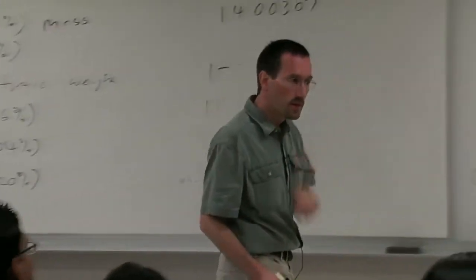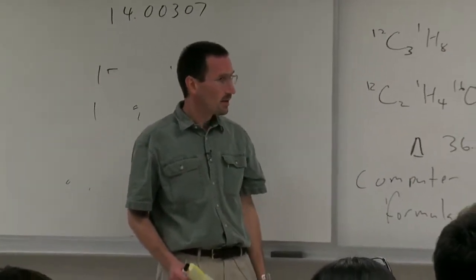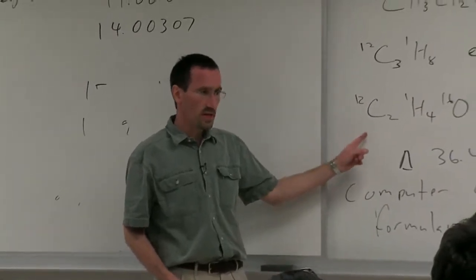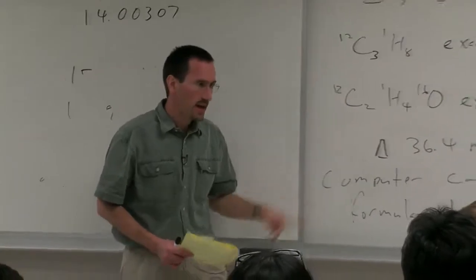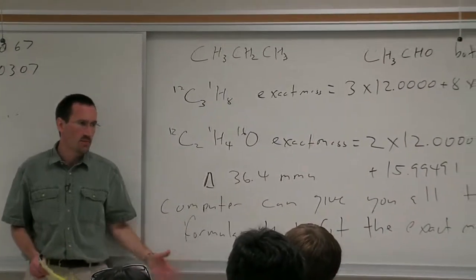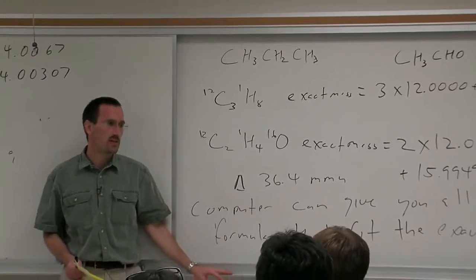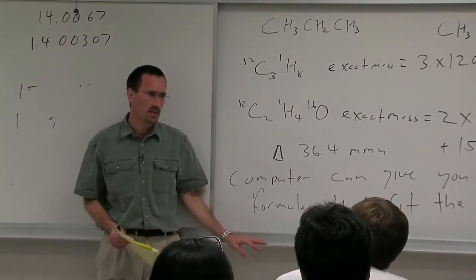Great question. Oh, I was going to say, this is only if you're looking at the parent peak, right? This is only if you're looking at the parent peak. And with EI mass spec, sometimes John Greaves will come back and say this is for a fragment, but it's a logical fragment of your molecule. Whereas with soft ionization, you usually can get it.